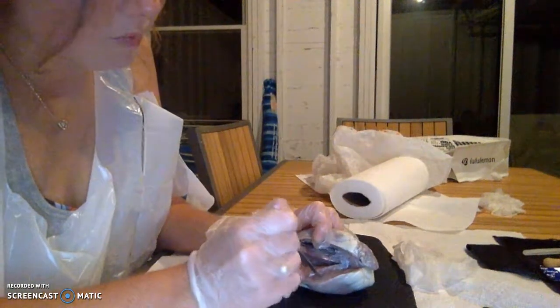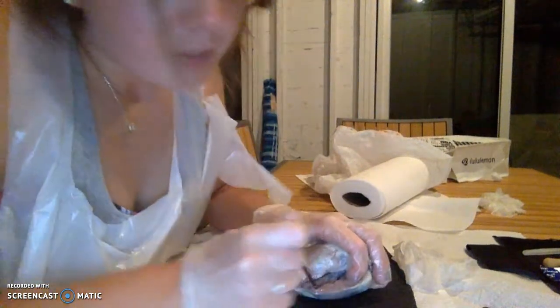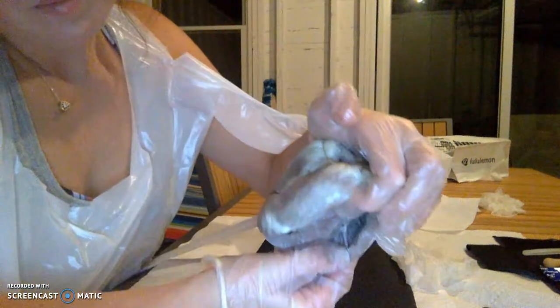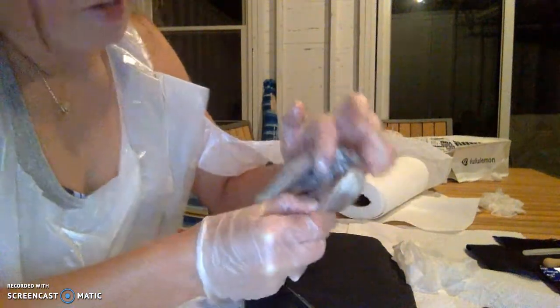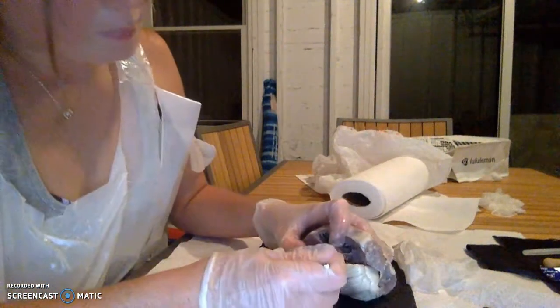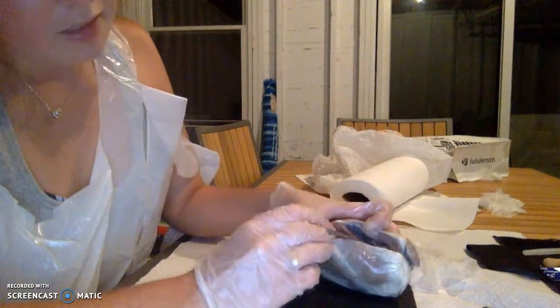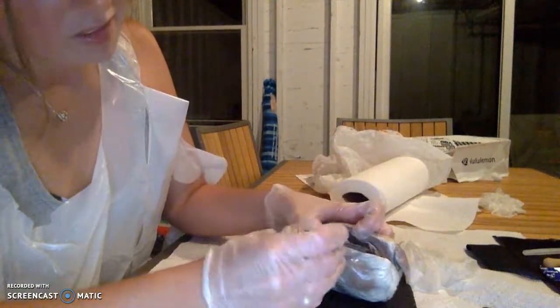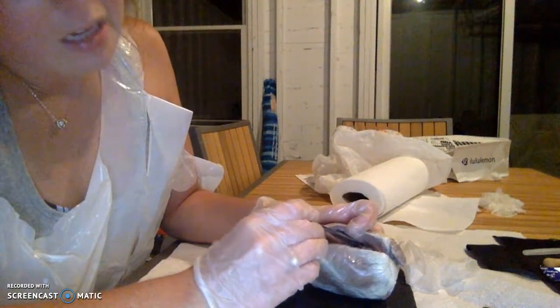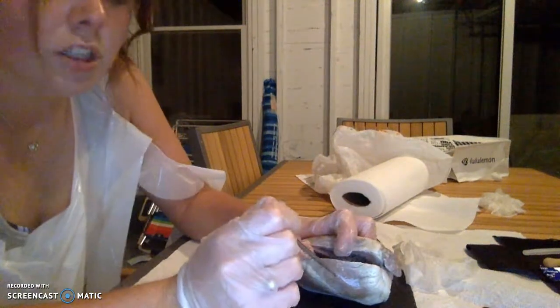Papillary muscles are back. Actually, a good view of papillary muscles. Let me see if I can. Papillary muscles right there, just kind of cool. Actually, very cool to see. And then you have the tricuspid valve in here, which separates the right atrium from the right ventricle.